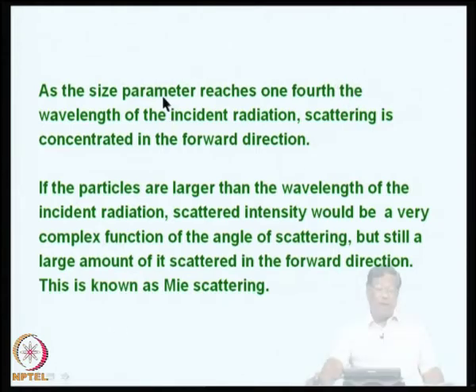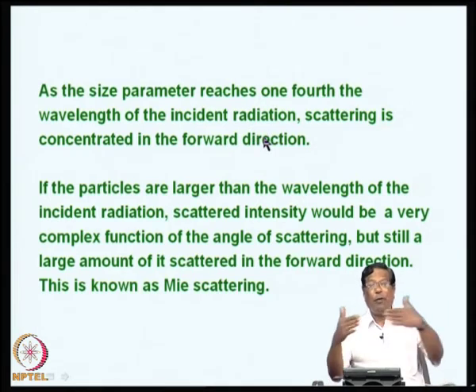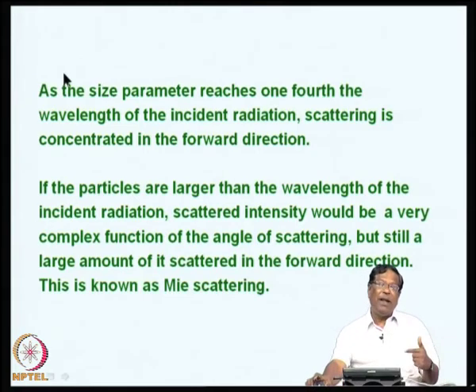Now, imagine the size parameter keeps on increasing and goes beyond the size of the wavelength, about 1/4 the wavelength of the incident radiation. Then the scattering is concentrated in the forward direction. That means, just like spectrophotometry, you can measure the absorbance in the same direction in which the radiation is passing through.